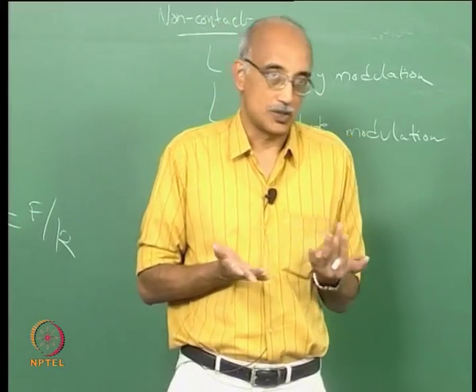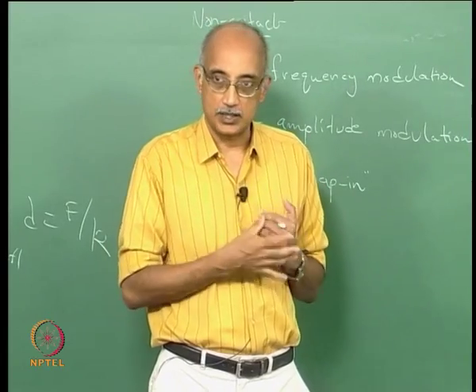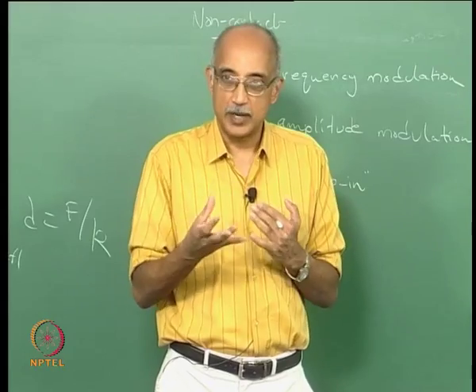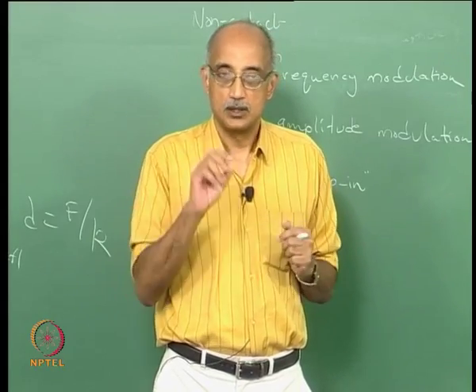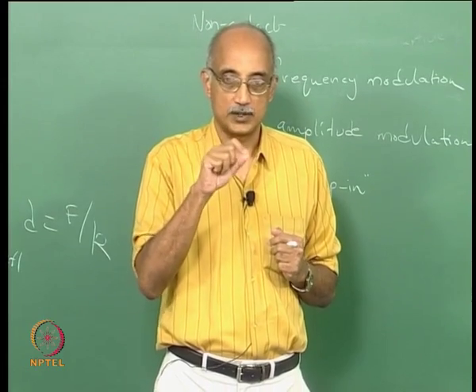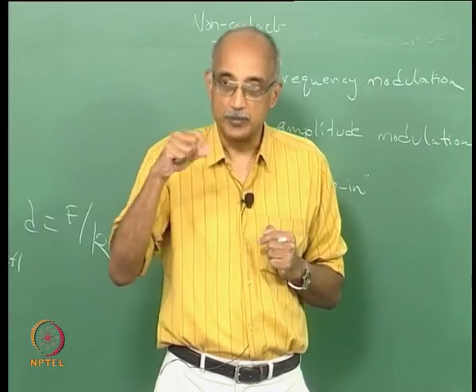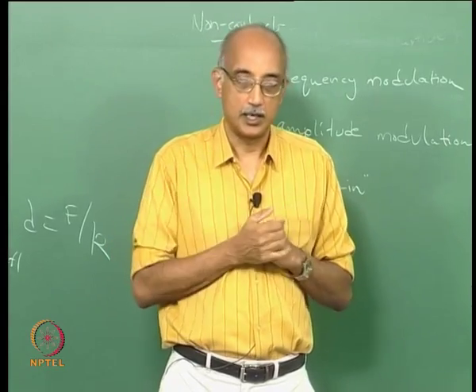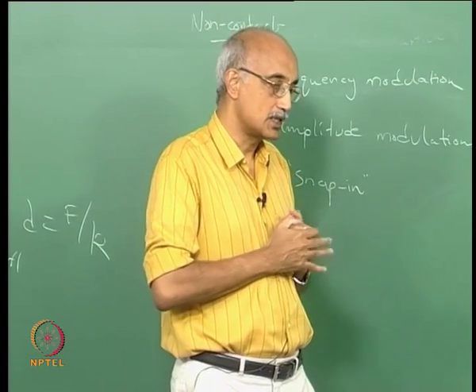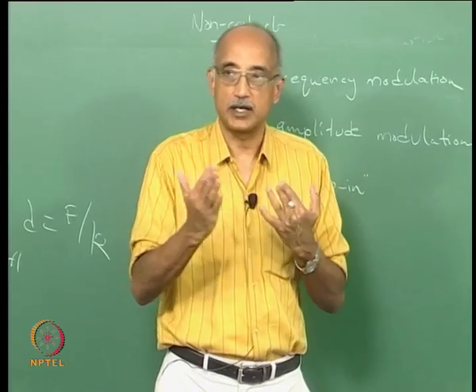Well, it happens naturally. If you take any substance and irradiate it with X-ray, then what is going to happen? It is going to set up an electromagnetic field. So, you have these electrons that are sitting around the atoms, and they are all going to want to start vibrating in response to this electromagnetic field, and as they do, they start essentially scattering as well as reflecting the X-rays.